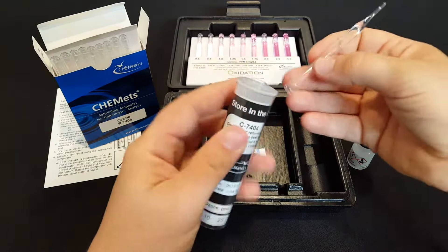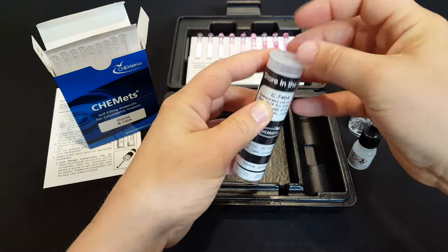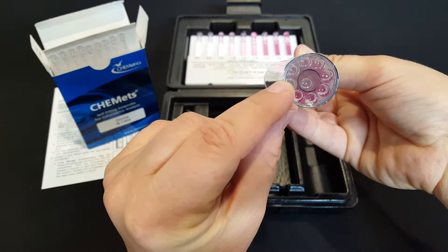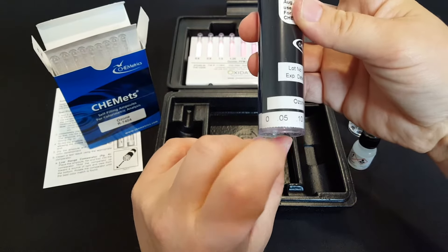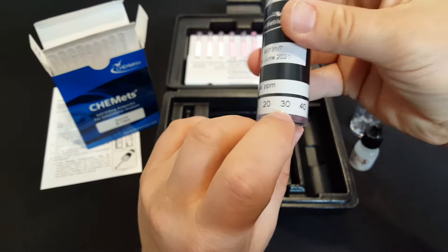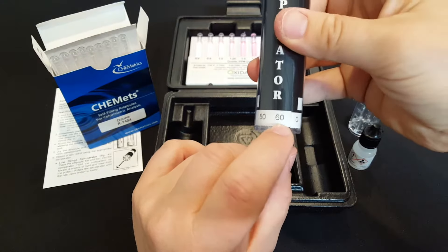If you have relatively low levels of ozone, you slide your test ampule down inside the comparator and see how it goes from a very light pink to a darker pink, corresponding with the levels of ozone. The lowest color is 0.05 parts per million dissolved ozone and this comparator goes up to 0.6 parts per million.